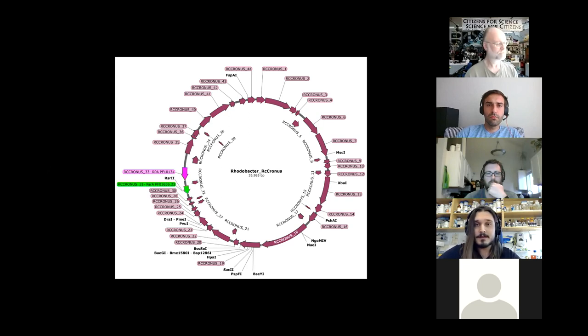And so we decided, okay, it's available on Carolina Biological, carolina.com. It's a great example of an extremophile in the sense of radiation tolerance, and there's no reference genome. So we decided to try it. And Christmas Day two years ago, we got scooped for the first sequence. We had all the data. We were finishing up assembly. We were polishing it all nice, and then somebody just brought out an Illumina genome.